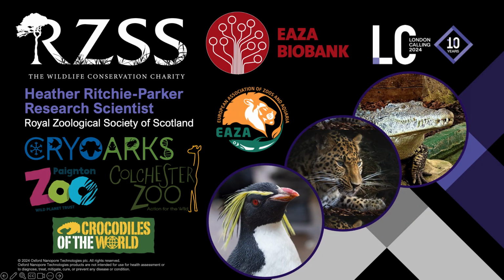RZSS is a conservation charity, and the RZSS Biobank is one of 4 of the EAZA biobanks across Europe, and it's a facility for zoos and aquaria across Europe to biobank samples to be used as genetic material. So one of these biobanks is in Edinburgh, and it acts as a repository for samples that have come from institutions within the UK. Having these biobanks is a really important facility, both for individuals that are in our ex situ collections, so our captive collections, but as well as their in situ wild counterparts.